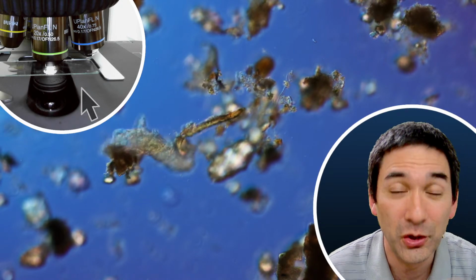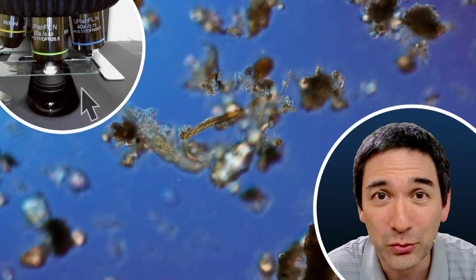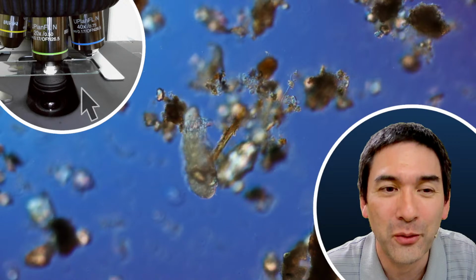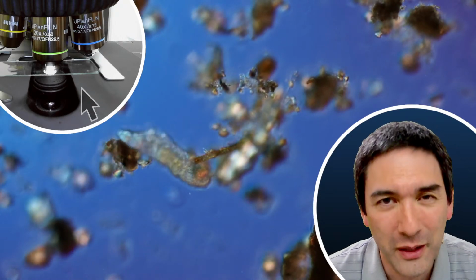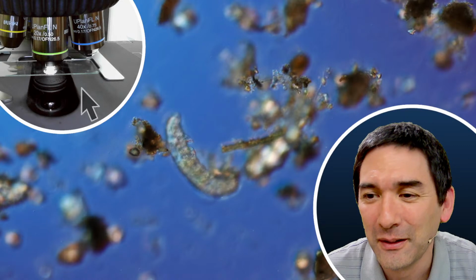This would also be quite decorative. Maybe it's also possible to grow a few fungi in there, so that I always have more things to observe under the microscope, not just water samples, which are quite easy because you just scoop up some water from a jar.